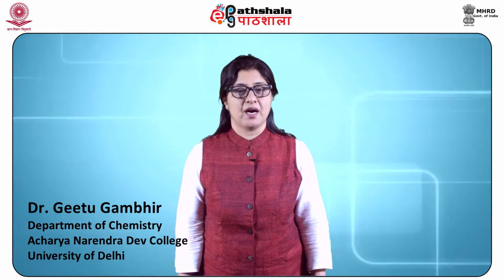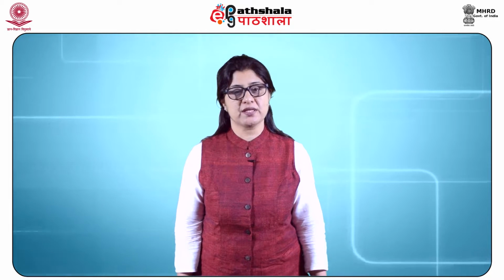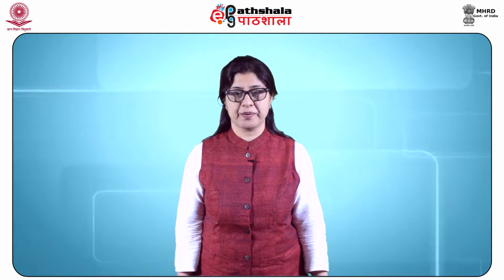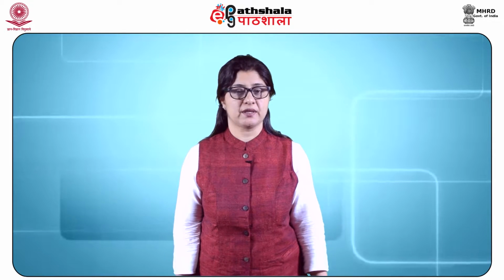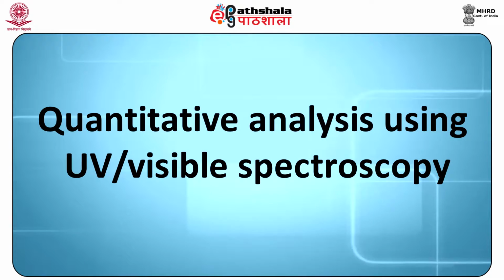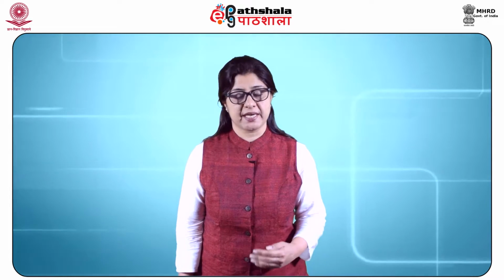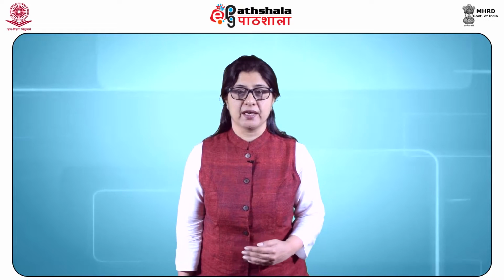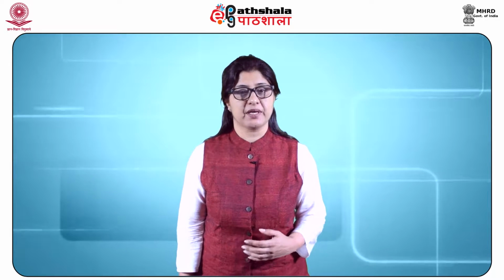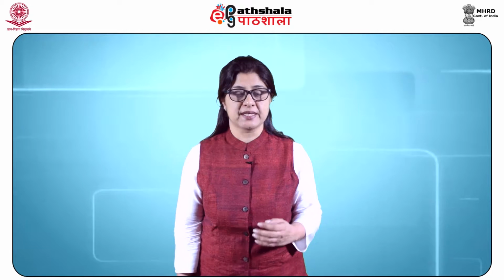Dear students, after studying this module, you shall be able to understand the usefulness of UV visible spectroscopy for quantitative and qualitative analysis. Initially, quantitative analysis using UV visible spectroscopy. The determination of concentration of a sample under study or analyte is one of the major applications of UV visible spectroscopy. Quantitative analysis involves the determination of exact concentration of analyte under study.